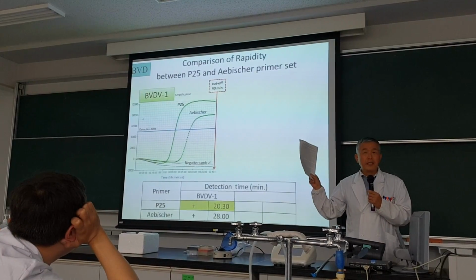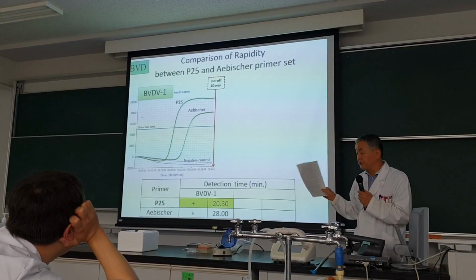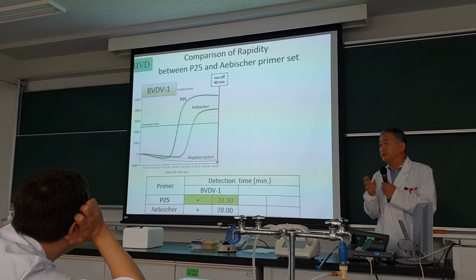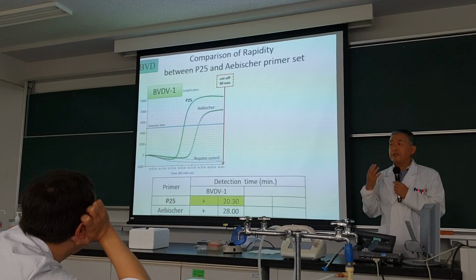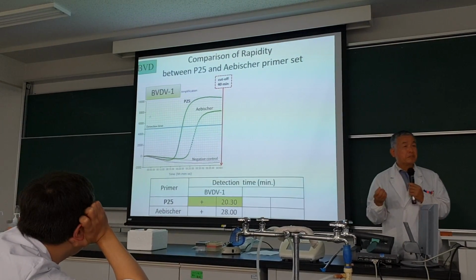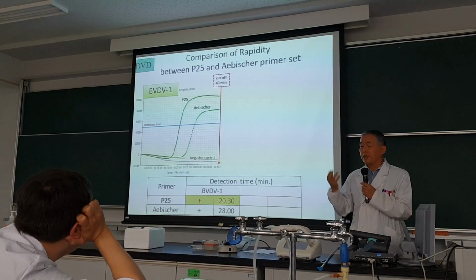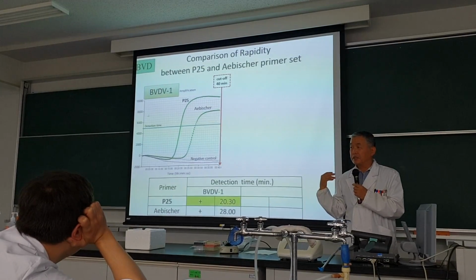Okay, in our veterinary field, some viruses have a very wide gene pool. Sometimes we don't know the real diversity in the sequences. So that is a very critical point to detect the viruses successfully. BVD is not covered by the currently published primer sets. Influenza was sometimes difficult before. Now we have improved the system to detect all of the genes registered in the data bank.